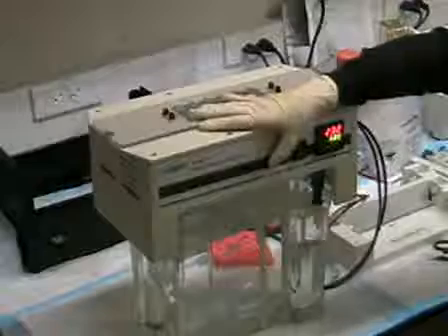This is not a normal acrylamide gel. It needs to be kept at 60 degrees when it's run, and the buffer needs to be pumped continuously. So we're going to warm up the buffer for about an hour until it's at 60 degrees, and then we can run the gel.